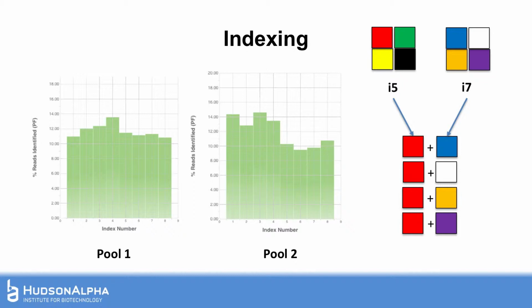Again, this is an early version of the kit, and I'm quite confident you'll see revisions to the indexing schemes in the short term. Over on the left-hand side of the slides, though, notice, so remember, pool 1 is all high-quality genomic DNA samples. And then pool 2 is the last 4 columns, which represent the 4 FFPE samples. The first 4 columns are the 4 germline samples. So not particularly surprising that we saw a small bias in the sequencing against the FFPE samples, but remember, this is also taking into consideration the 8-plex capture.